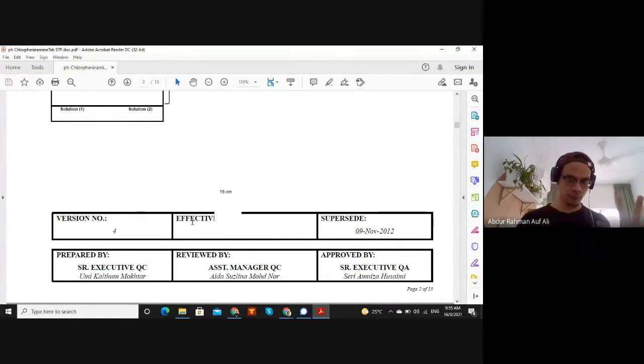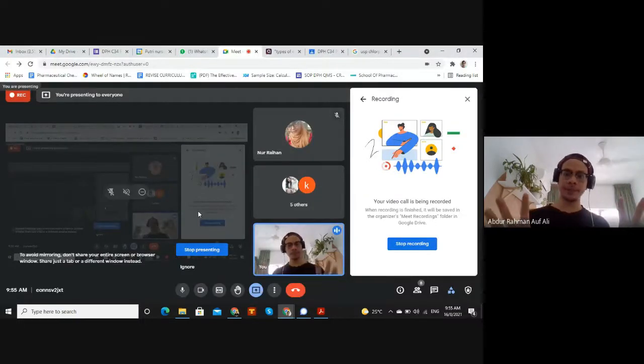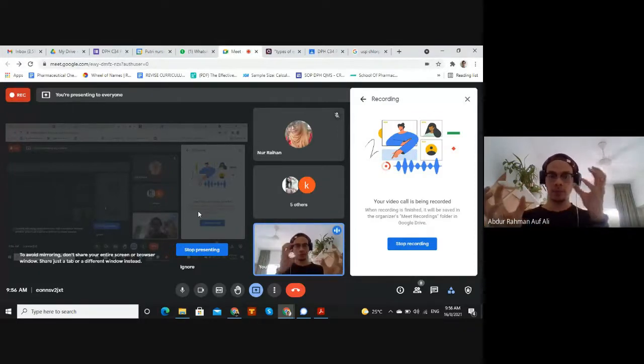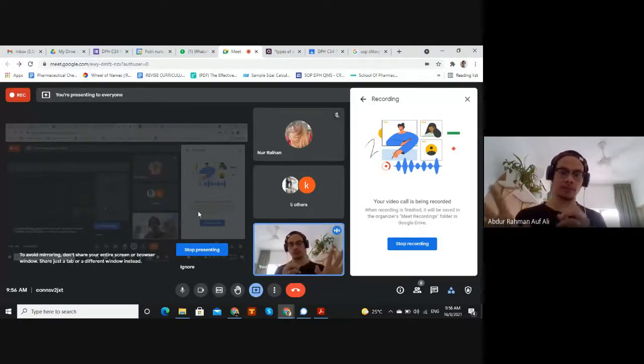Kalau kamu rasa macam overwhelmed banyak sangat, so kenapa nak kena tahu semua benda ni? My point is, saya nak kamu tahu how we pharmaceutical chemists perform a test. So in essence, kalau kamu macam blur sangat, kamu hanya perlu tahu untuk buat test, basically kita perlu bandingkan our sample, our tablets tu dengan sesuatu bahan yang lebih tinggi ketulinan dia. Kita perlu compare, kita perlu bandingkan. Itu yang saya nak kamu dapat from apa yang panjang-panjang saya cerita tadi tu.